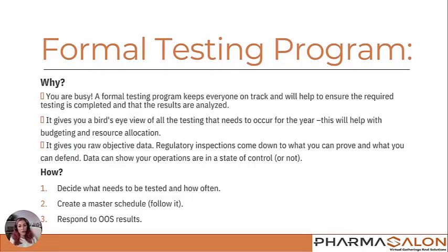Now, you might be wondering, why exactly do I need to create a formal in-house testing program? You're busy. I mentioned it earlier. Compounding pharmacies are always busy. The formal testing program is going to help keep everyone on track, and it will ensure that the required testing is completed and that the results are analyzed.